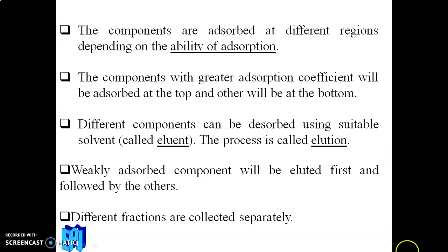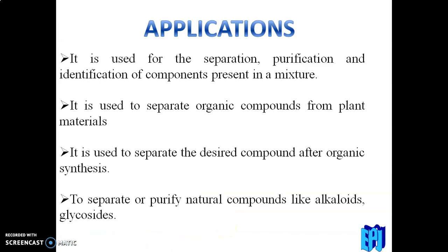Weakly adsorbed components will be eluted first, followed by others. Different fractions are collected separately, as we know. Then let us discuss the applications.